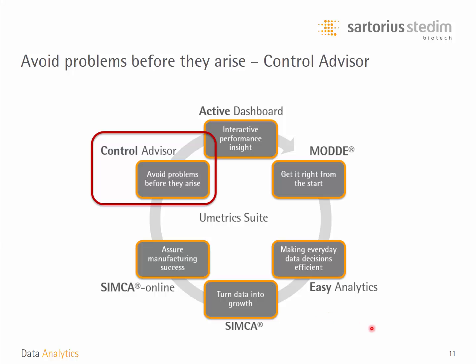Part of the SIMCA Online solution also contains something called the control advisor. So with the control advisor, we can look into the future and try to avoid problems before they arise.